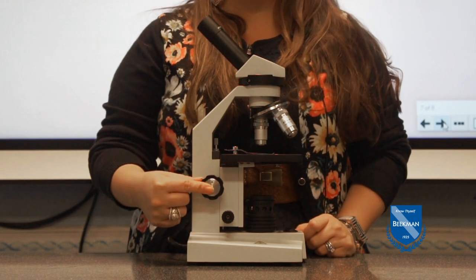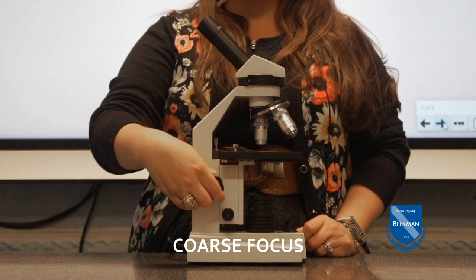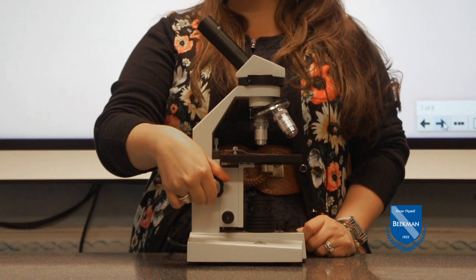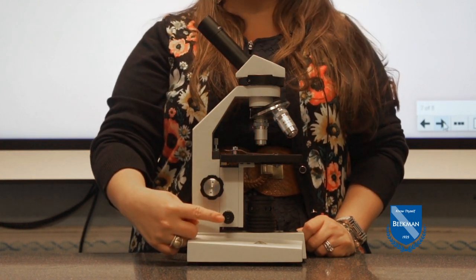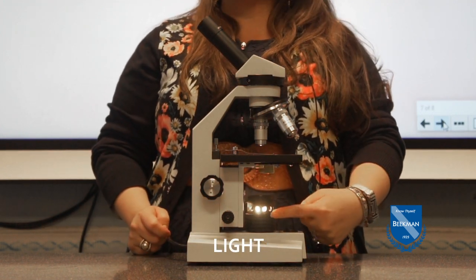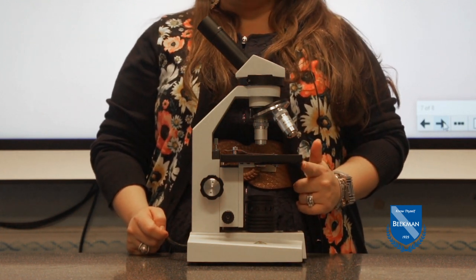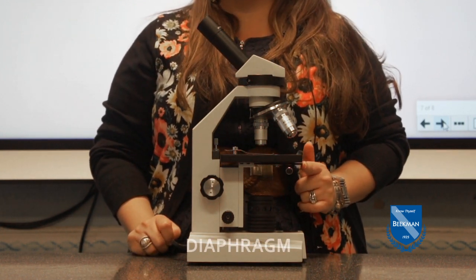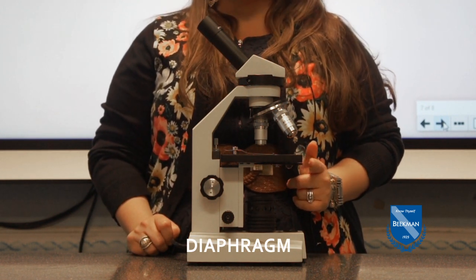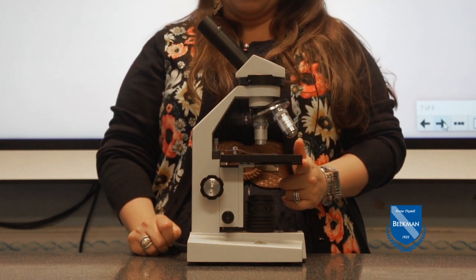The next thing we have is the coarse focus. Notice when I turn this knob, the stage actually moves. This will help you get your first view of whatever is on your slide. Once you have a view of what's on your slide, you sharpen the image using the fine focus. The light comes in right down here. On the side or underneath your microscope stage will be something called a diaphragm. The diaphragm is used to let more or less light in, helping you to really get a good view of whatever it is you're trying to see.